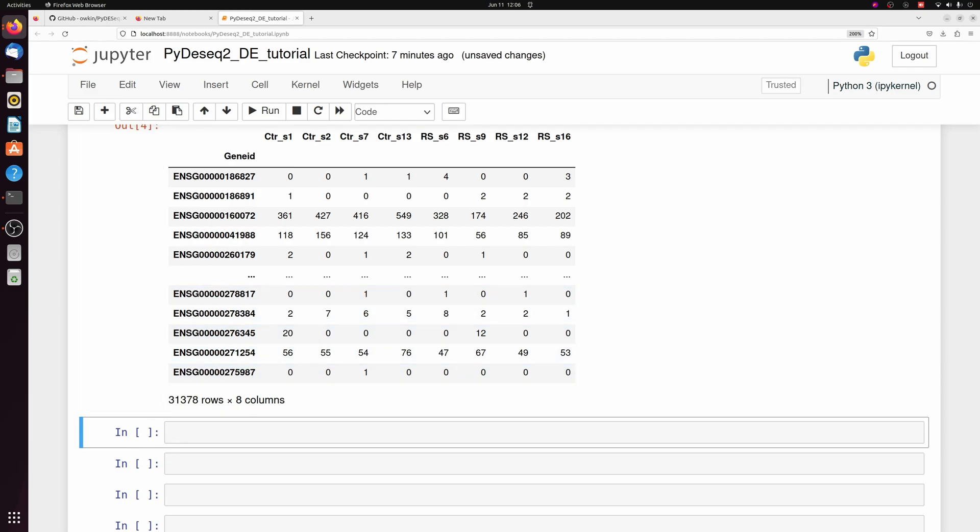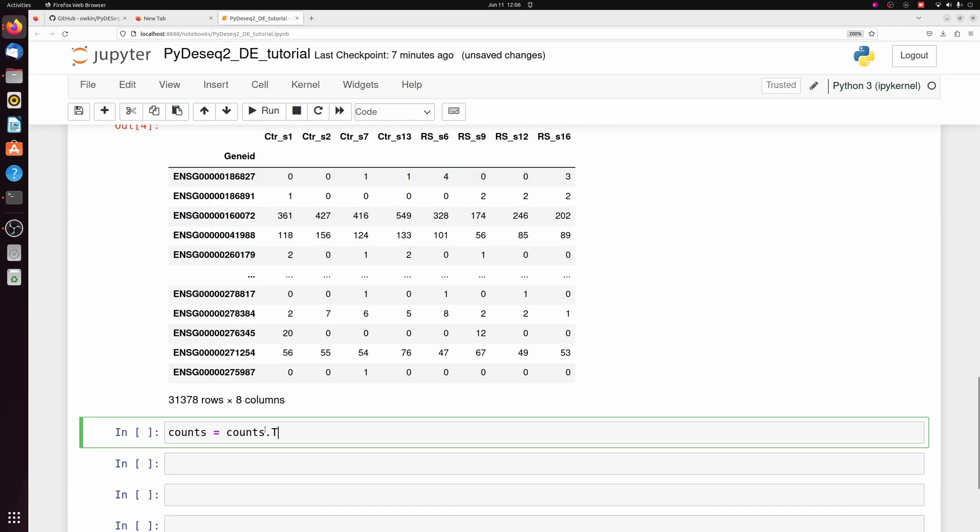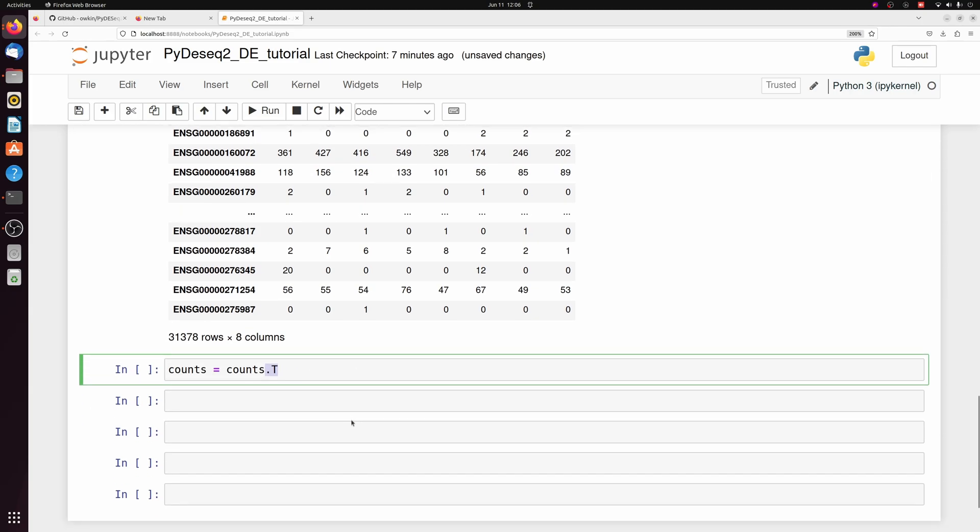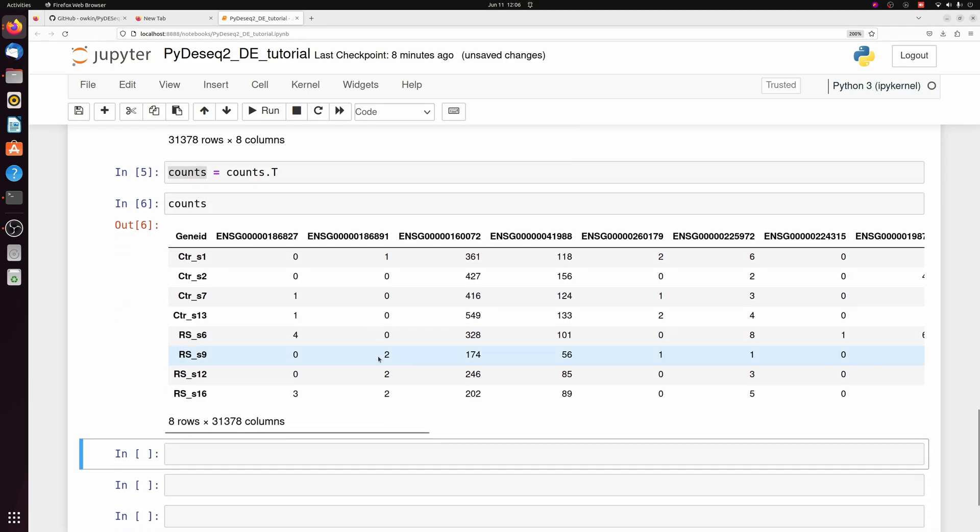And then for PyDseq2, we need to transpose the counts table. So we need the gene IDs to actually be the columns and the samples to be the rows. So we can just pass the .t for transpose. So our counts table is now ready.